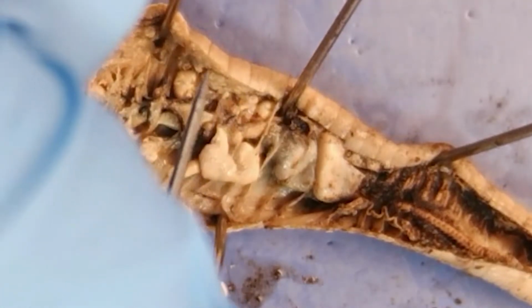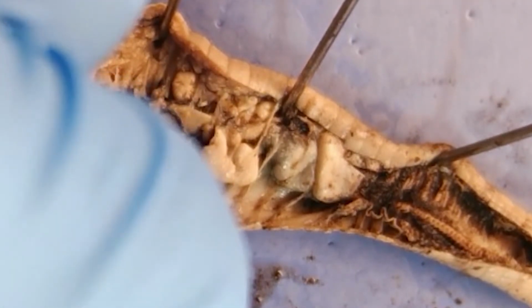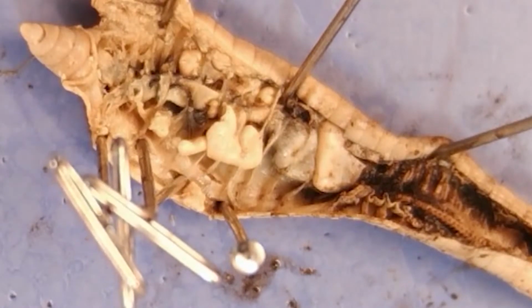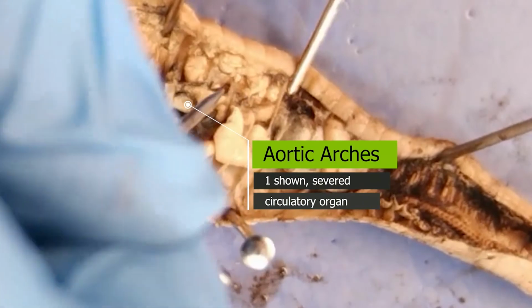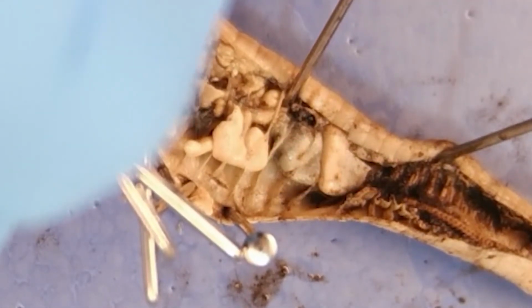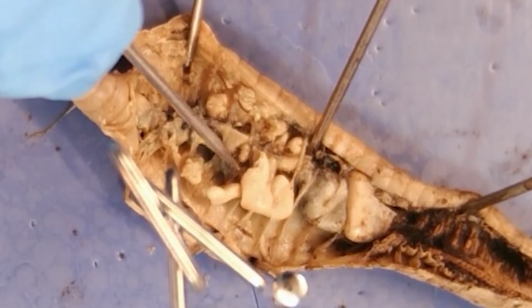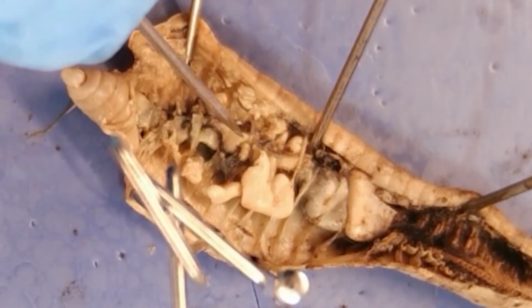Yep. It's hard to see, but here there's like a little black strip on either side, and those are parts of those aortic arches. I can see part of one here too. And literally the arches, basically they arch over the esophagus, or the food tube. So from this one you can actually see here part of the esophagus, and then there's a little dark spot there that here and here are bits of the aortic arches that have been cut. And again, they basically arch over the esophagus.